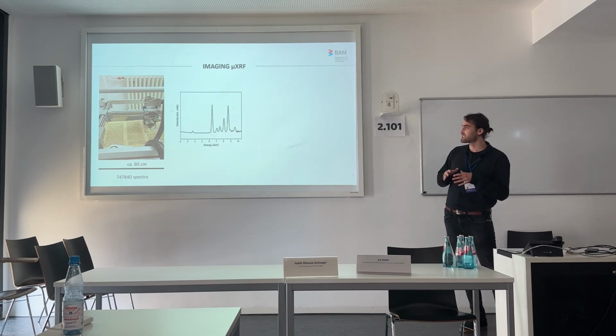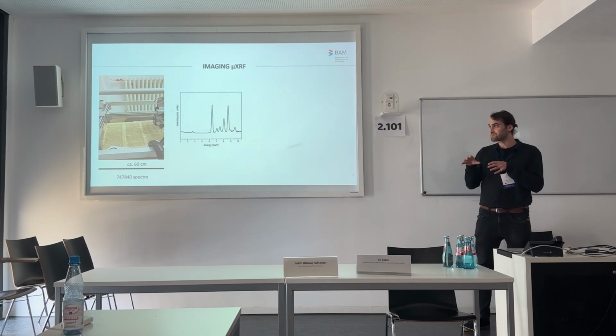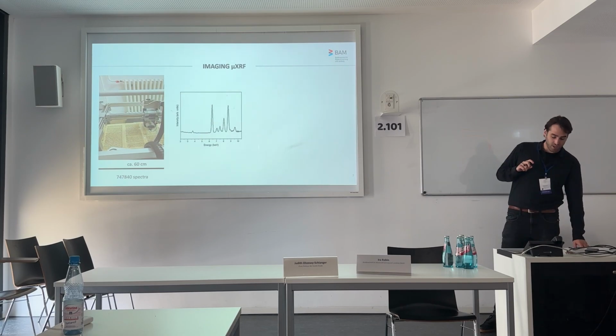One of the tools which I love using, and I've been using a lot throughout my PhD and previous works, is an imaging µXRF. Such a device moves the probe, as you can see in the image, over the area which one is investigating, and collects spectra, such as the one shown in the middle of the slide.